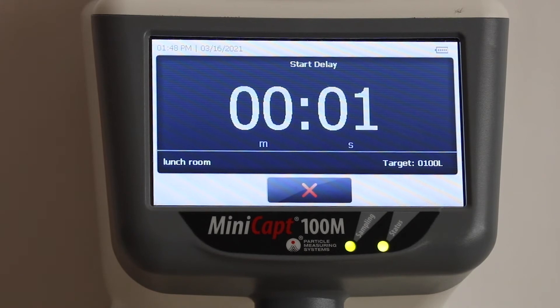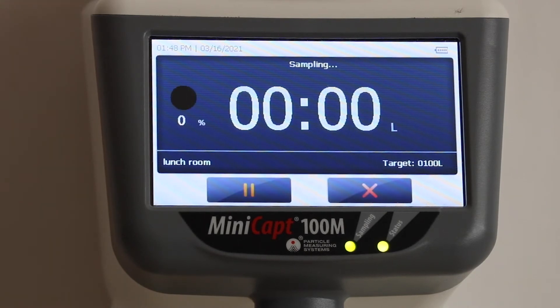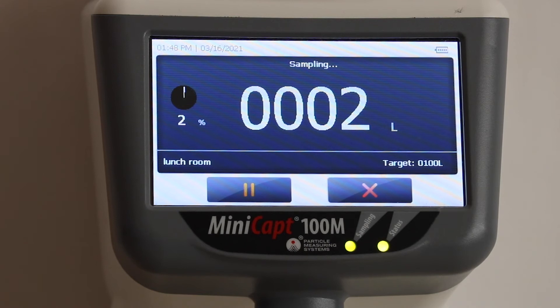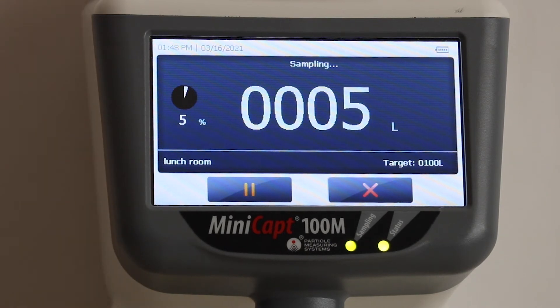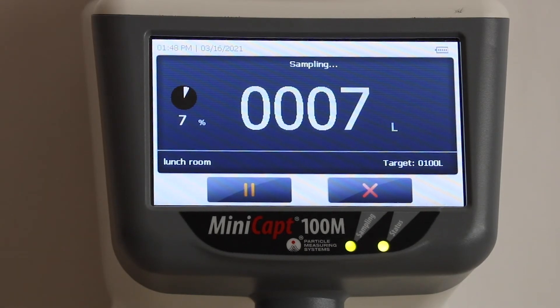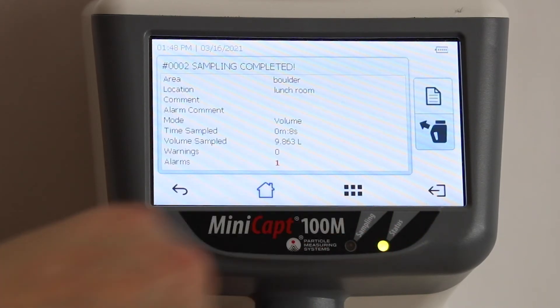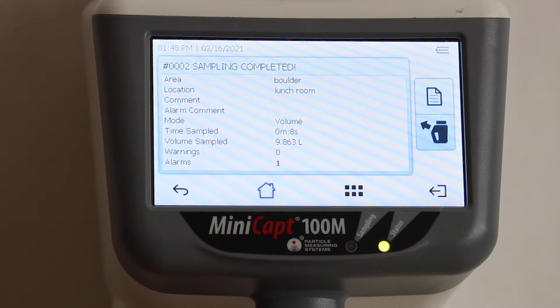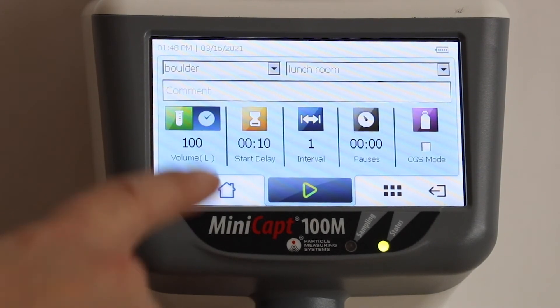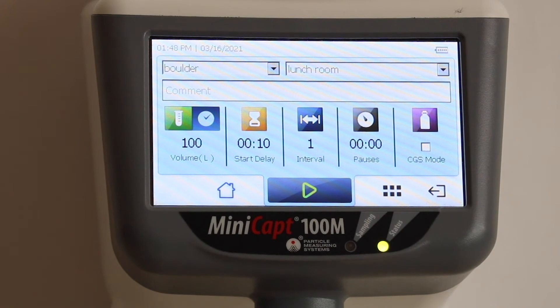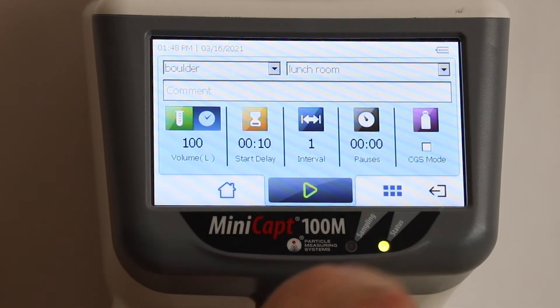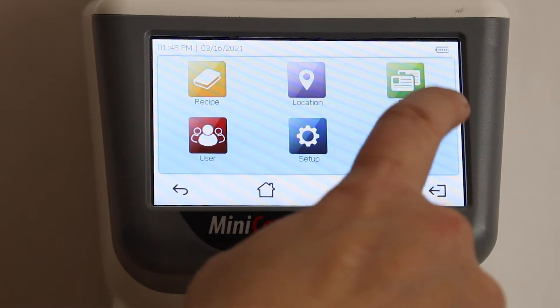I'll hit the green start button and the sample will begin. Notice the start delay — the instrument is not sampling at this moment, it is simply waiting and counting down. Now the instrument is sampling. I'm going to stop it early — you don't need to watch the whole sample — and you'll notice there was an alarm. That just means the sample did not complete, and that alarm will always appear on the report for review.